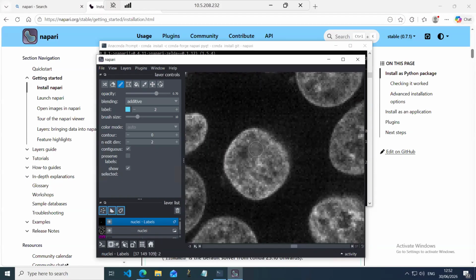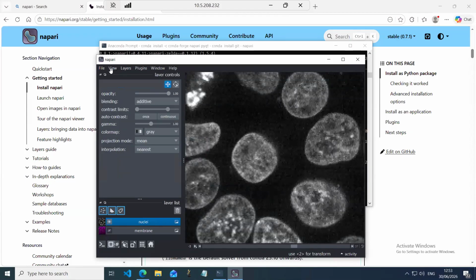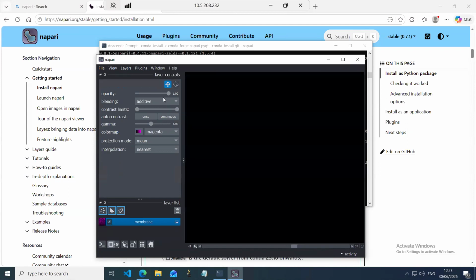The goal of the plugin is instead to try to obtain this in a point-and-click method. So we will rely on the use of watershed. So apologies for this. This is not showing. It should be working. The plugin does not focus on this. So I will delete this data set here.